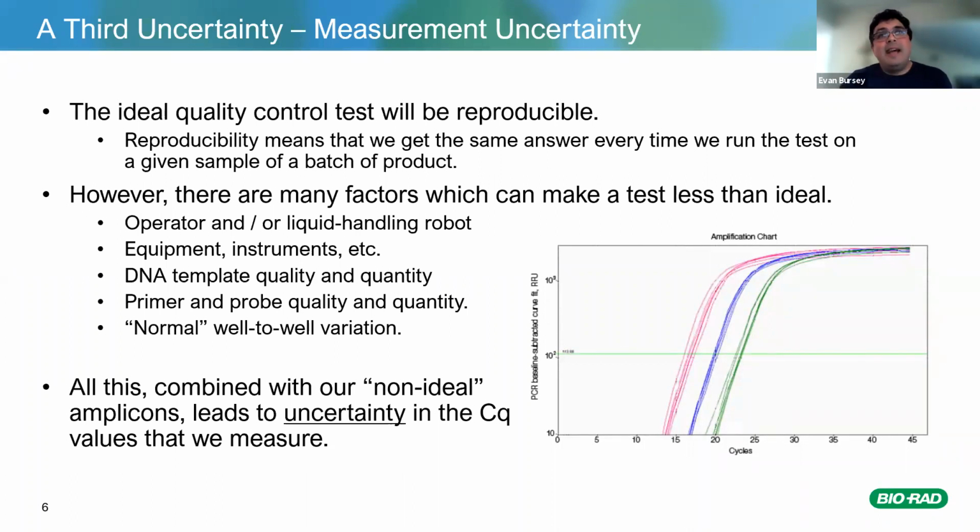Well, in reality, you don't always see perfect efficiency from cycle to cycle to cycle. This time in this particular well, only 97% of those templates got copied. And over in this well, it was only 95%, and so on. And the more you cycle, the more those little changes from well to well over each cycle will add up and will cause noise in your results.